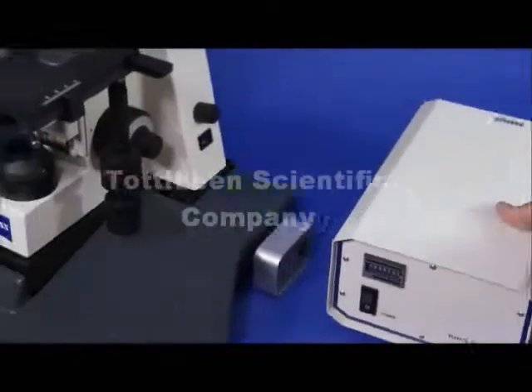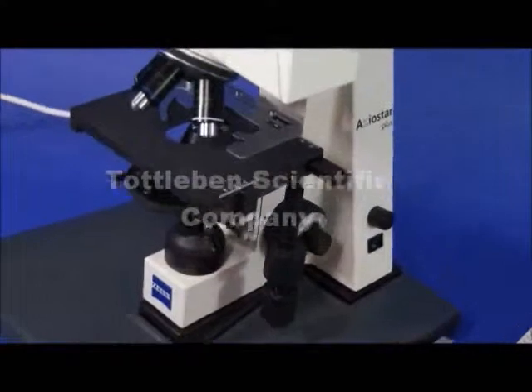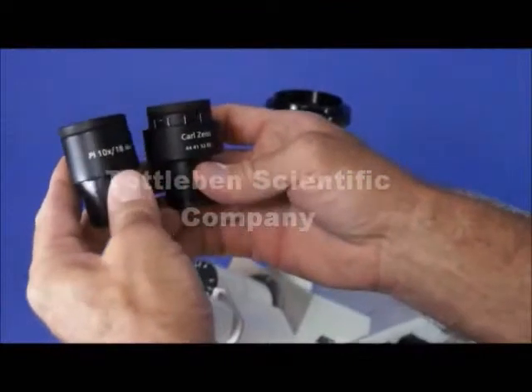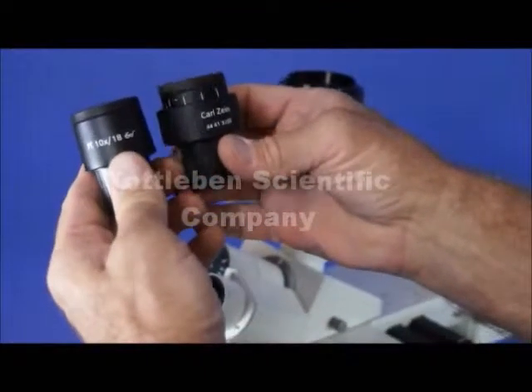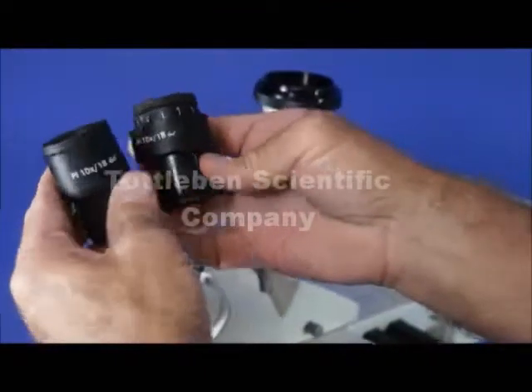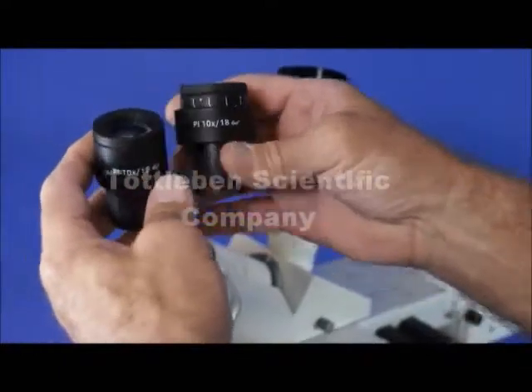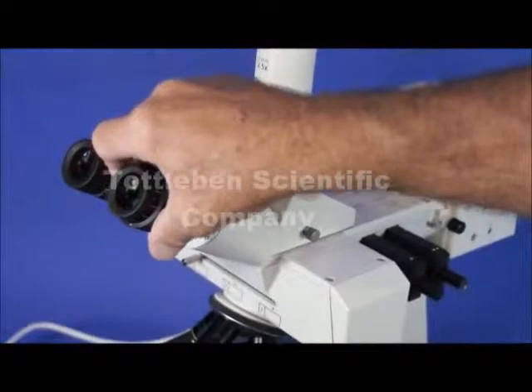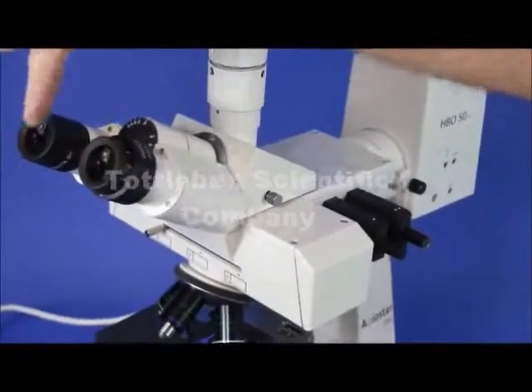Starting at the top, I'd like to introduce you to a few of the accessories on this microscope. We have the famous Carl Zeiss eyepieces. They are PL 10X 18 field number and they're equipped and corrected for eyeglass wearing, so that a person who wears eyeglasses doesn't have to take them off — it will accommodate for your high eye point.